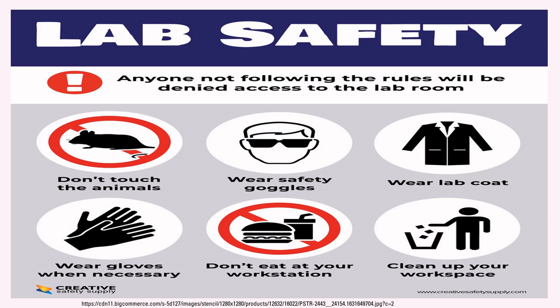Wear gloves whenever necessary because it would help you in contact with your microbes or specific chemicals. Never eat at your workstation. If you eat, these might invite other animals like mice, then it can allow the growth of microbes and others which can spread the diseases. And always before leaving the lab, clean up your workspace so that when you come for next lab, you can do it with ease.